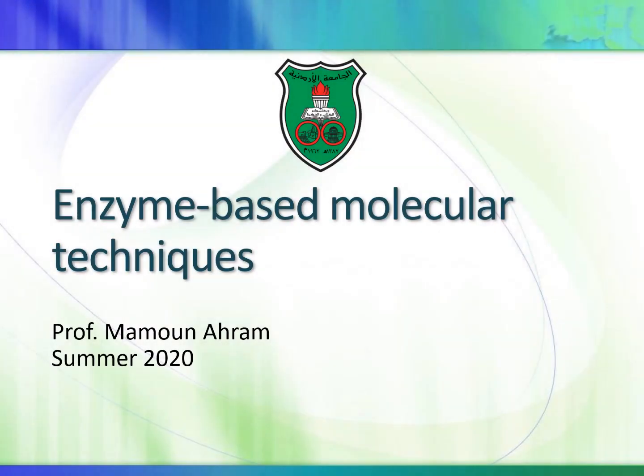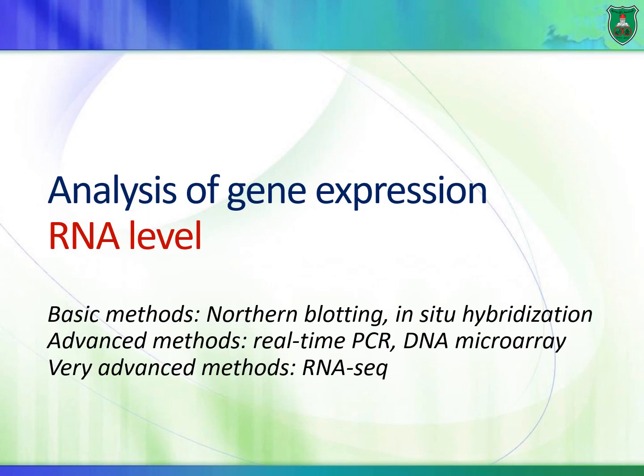Assalamu alaikum. So this is the third lecture of the second topic, enzyme-based molecular techniques, and we're going to talk about a number of techniques related to analysis of gene expression via measuring the levels of RNA.